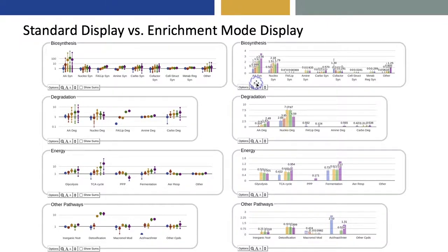So that's essentially telling us that there is more detail that's worth looking at inside this particular plot. It's suggesting that we might want to click on that plot. Now, it's also worth noting that there are some differences between the left side and the right side. For example, nucleotide degradation is showing very high enrichment scores compared to the fold changes shown over here.